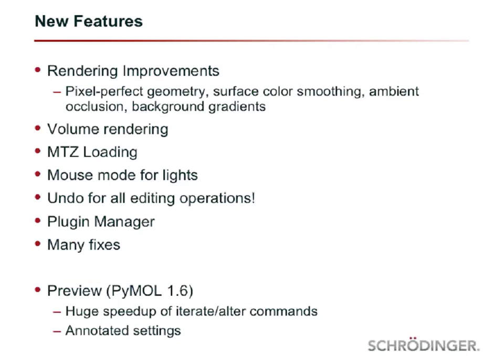I want to briefly go over the new features that we are working on, or that Schrodinger implemented in the last 2 years. If you have done figures with PyMOL before, you probably know that you would do a ray tracing before saving, before you put it into your PowerPoint slide.